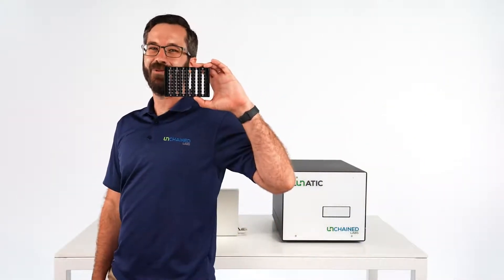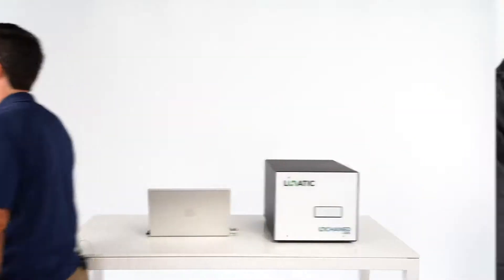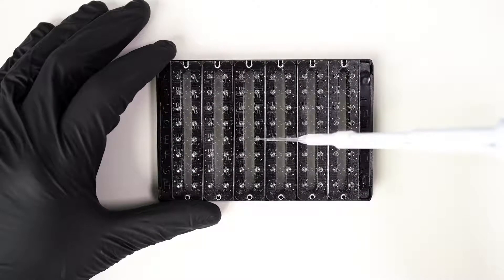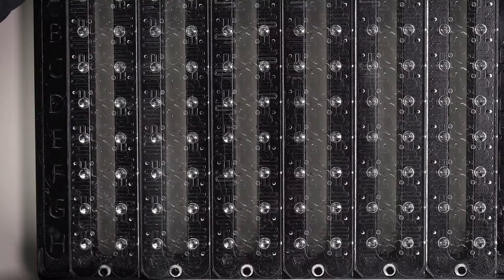Let's load up a plate and check out how a measurement works on Lunatic. Just pipette two microliters of sample into the input wells and you're done. Pretty easy.